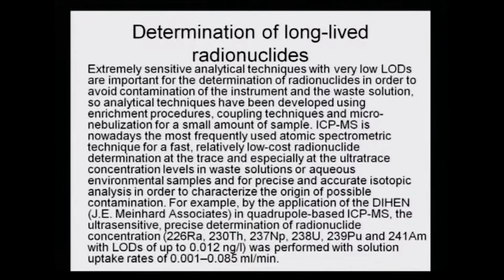You see, the whole procedure has been modified and slowed down to such a micro nebulizing flow that the intake of the sample is very small. If the uptake rates are as low as 0.001 to 0.085 ml per minute, you can imagine that the sample size is so small, and they can be analyzed up to a limit of detection of 0.012 nanogram per liter.